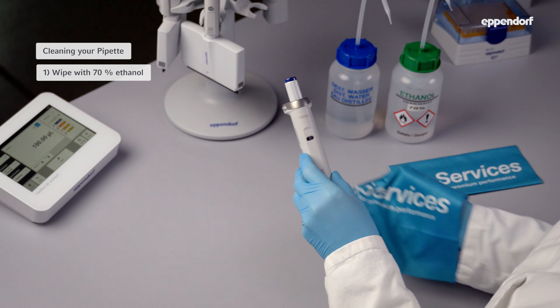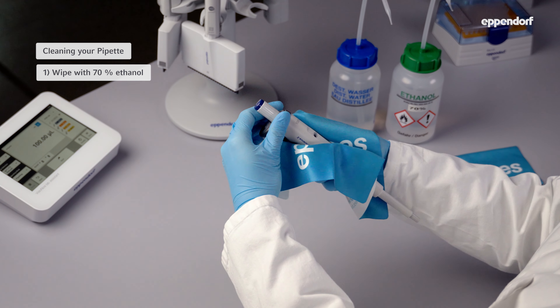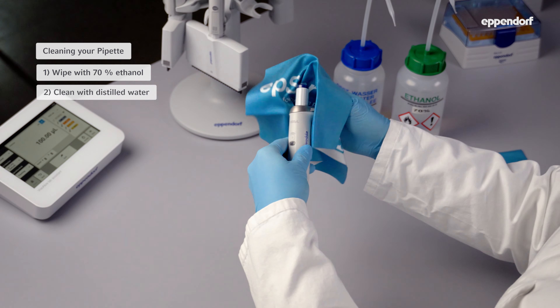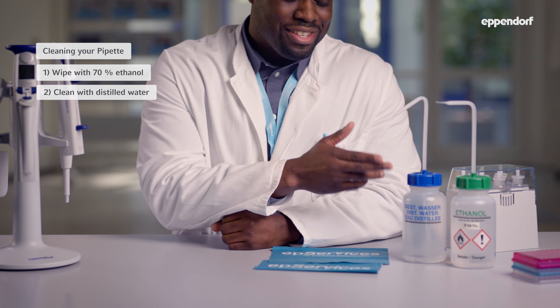Pipets should also be cleaned every day. Just take a lint-free cloth, dampen it with 70% ethanol or a mild detergent and gently wipe the surface of your pipet. Be careful to clean all the parts, especially the tip of the cone. Afterwards, you should wipe off the cleaning reagent with a cloth soaked in distilled water.